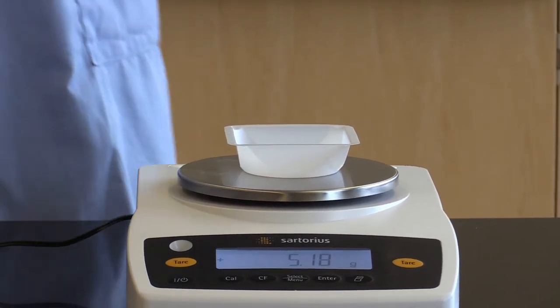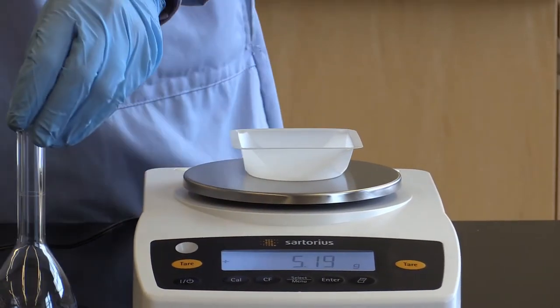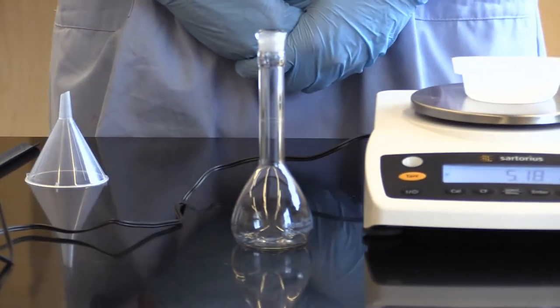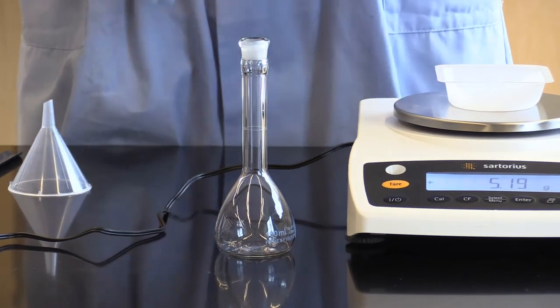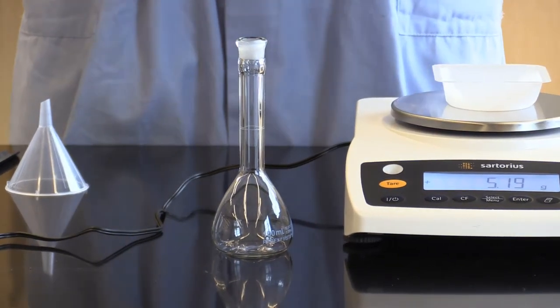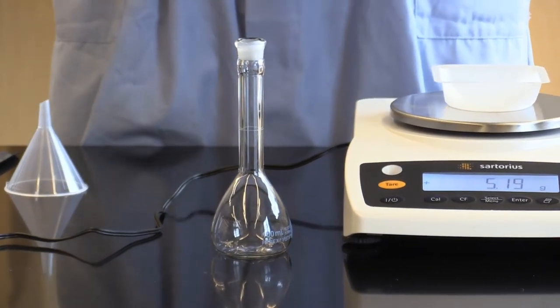And then today we are going to use a volumetric flask. It is one of the most accurate instruments that we have available to us in the lab, and this will allow us to accurately measure up to 100 mils. They do come in a variety of sizes.